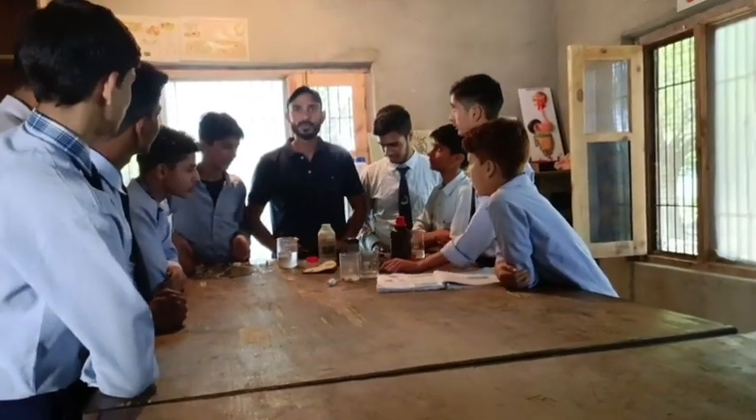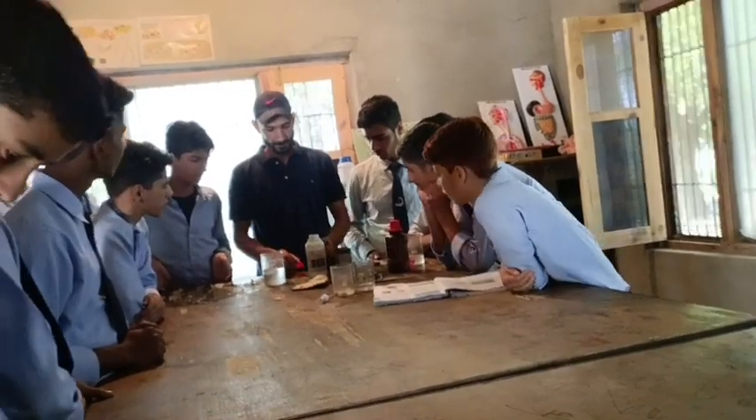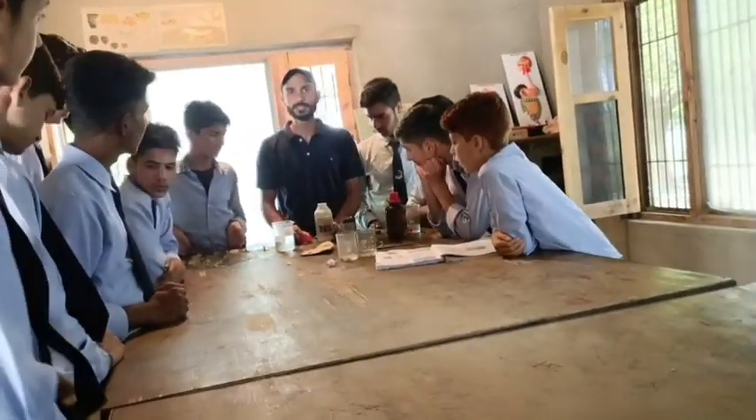Students, today our aim is to study electroplating — that is, how electroplating is done. So for this we need some materials.